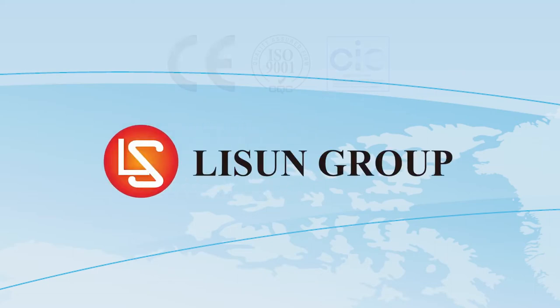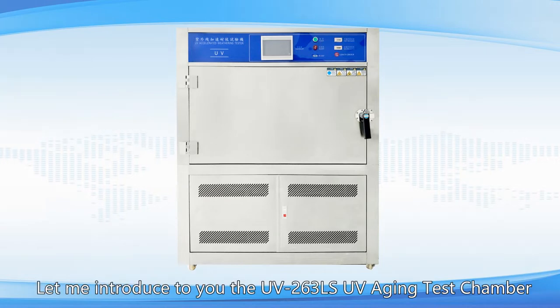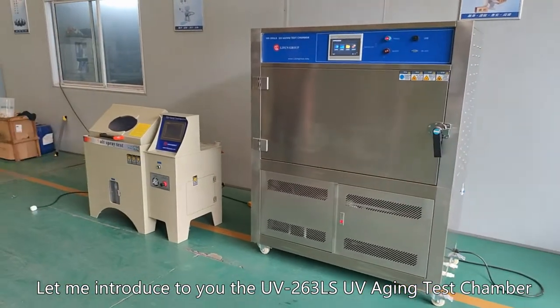Lassun is a leader in lighting and electrical test instruments. Hello everyone, let me introduce to you the UV-263 LS UV Aging Test Chamber.